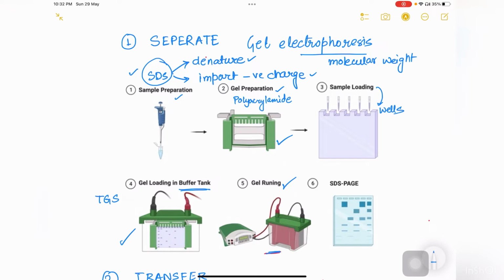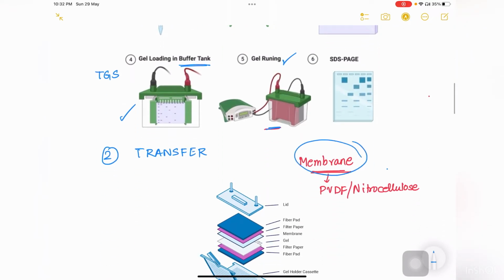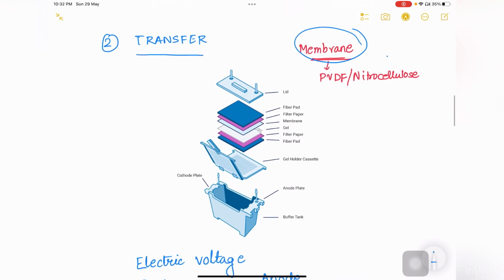So now we will transfer these proteins from the gel onto a solid support, which will be a membrane. What is the necessity of the membrane here? The membrane will help in detection of the protein in the subsequent steps. So this is the transfer process. The membrane which is typically used is PVDF or nitrocellulose.